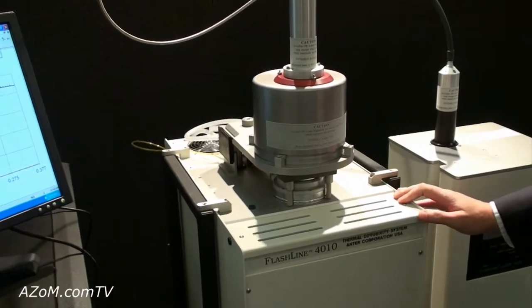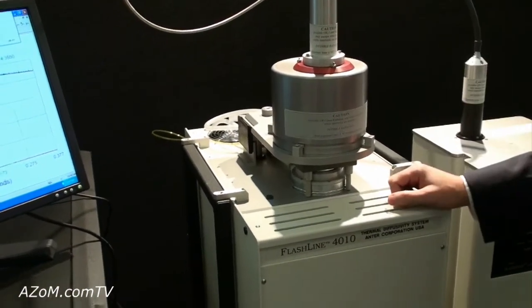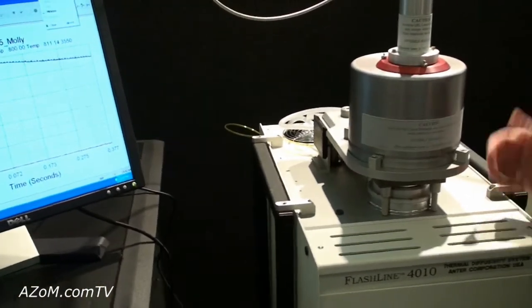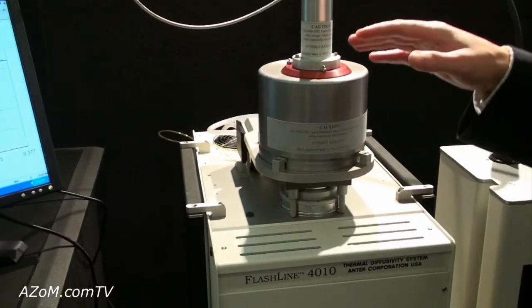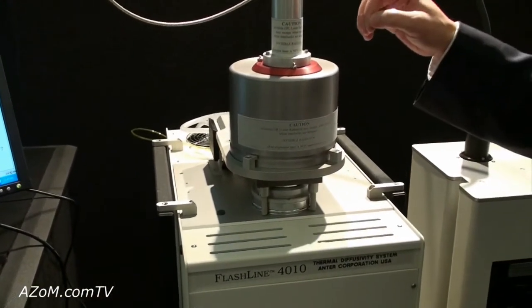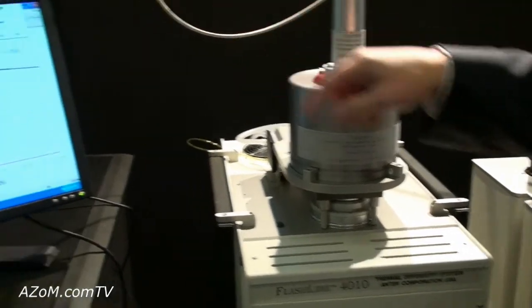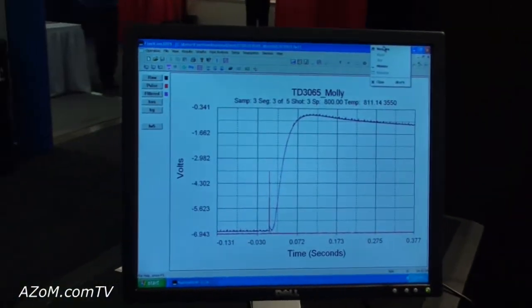By that time, you would already have your parameters input into the computer and the test would be ready to run. Now once it gets to temp, it would flash that sample. The thermogram over here shows a typical result of an unknown.